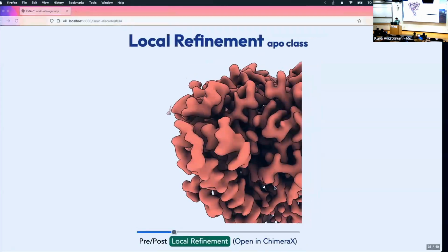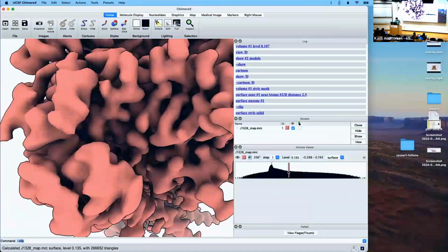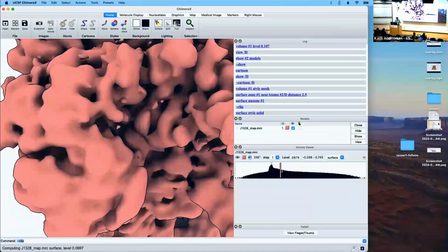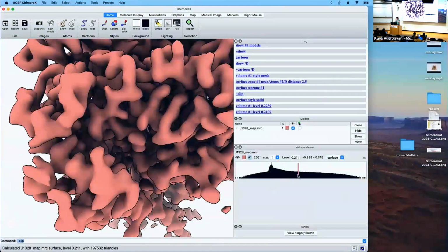I can convince you that it really is gone. We can open this up. And even as I contour down, you know, it's okay. There's a little noise there. Maybe the classification wasn't quite complete, but if you compare this, right, we have to come all the way down to where we're basically looking at nothing to see even that slight little blurring, compared to earlier where it was this clear little bit of noise there that might have been ligands, right?